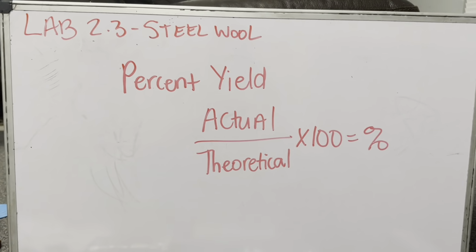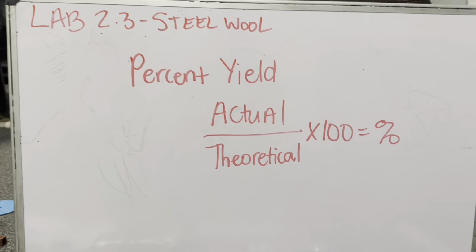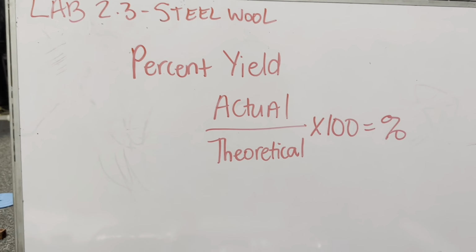Welcome back for lab 2.3, burning steel wool. So this lab is all about percent yield.